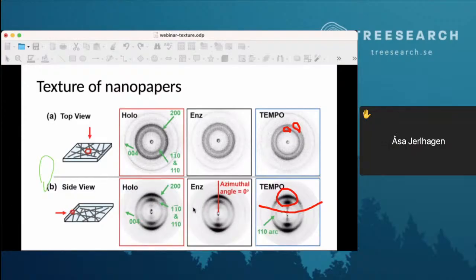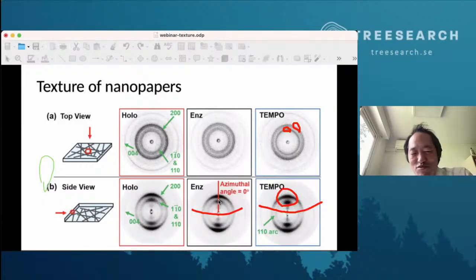Here you are cutting here, and because you don't see preferential orientation, they are all weak. It's weak because it's thin, but also because it's rare. And you see the 004, which actually appears strong in this pattern.